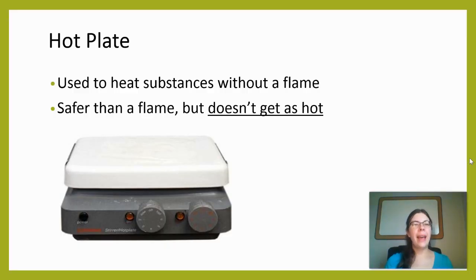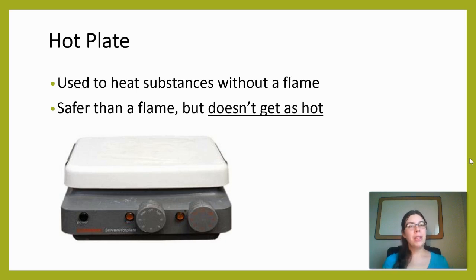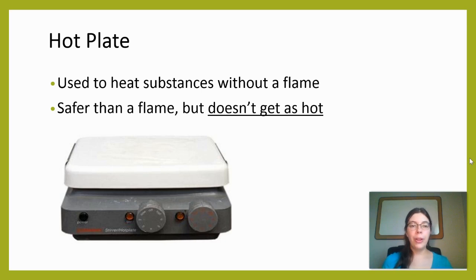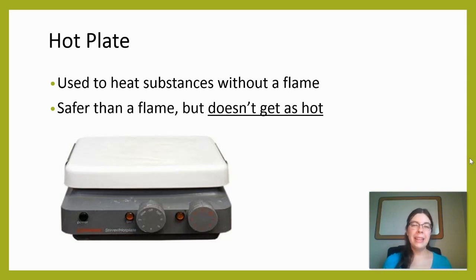The first type of heating device is a hot plate. The benefit of a hot plate is it uses electricity to heat up objects, so it doesn't have an open flame. If you have something very flammable like an alcohol, where you don't want an open flame that could cause a fire, a hot plate is a much safer option. However, it doesn't get as hot as the Bunsen burner, so we need that other option as well.